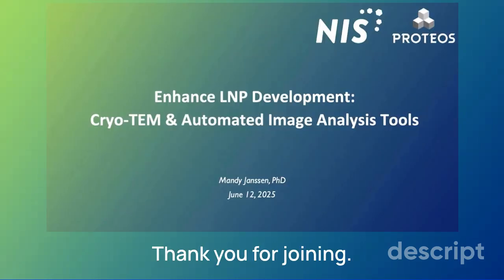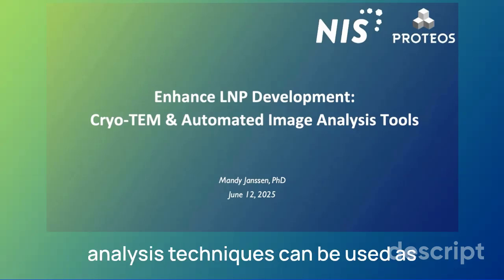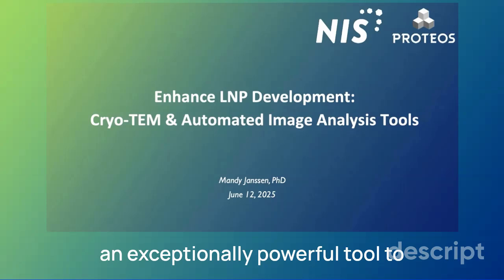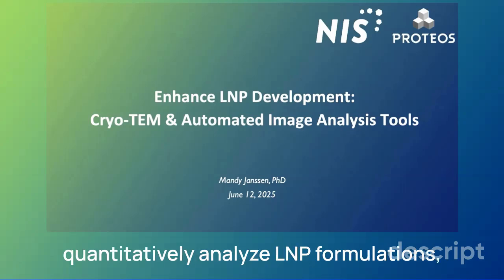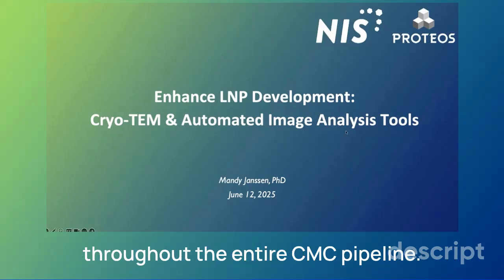Hello, thank you for joining. Today, I will show you how Cryo-TEM imaging and advanced image analysis techniques can be used as an exceptionally powerful tool to quantitatively analyze LNP formulations, not only during early development, but throughout the entire CMC pipeline.